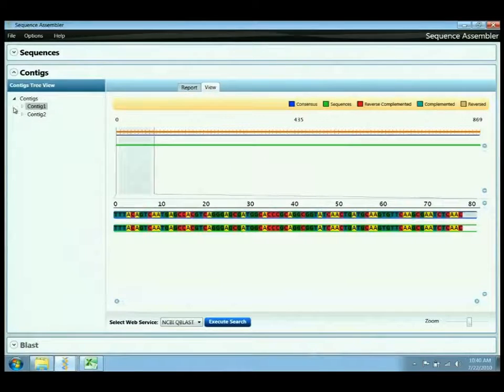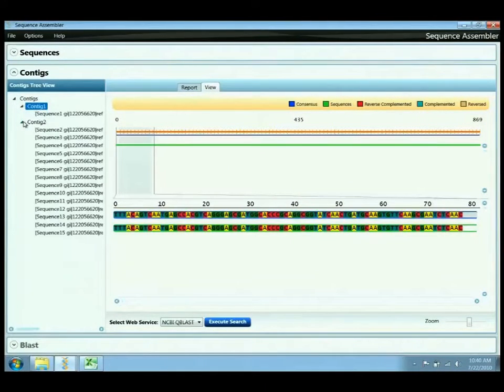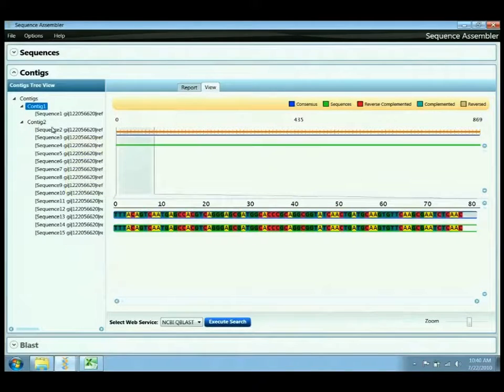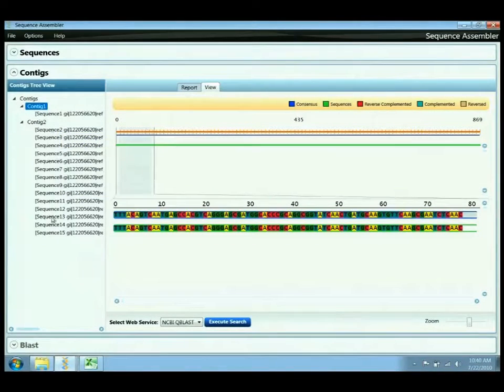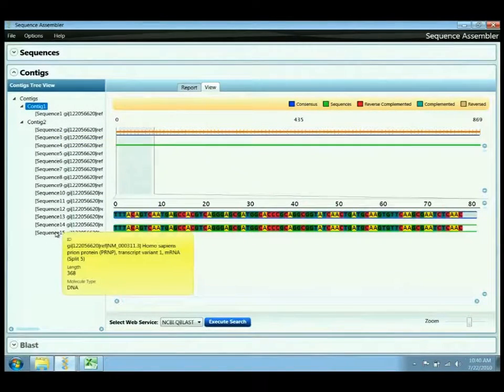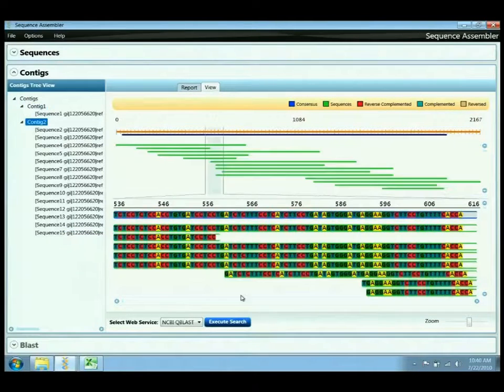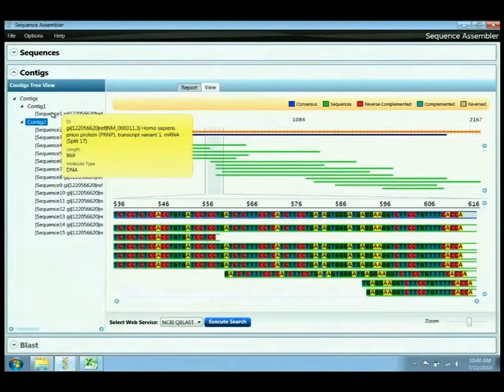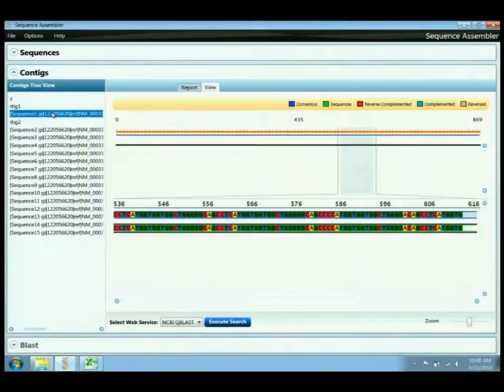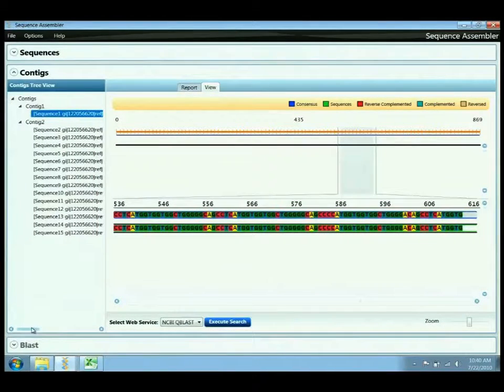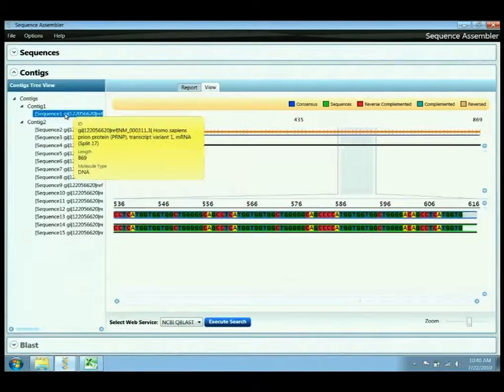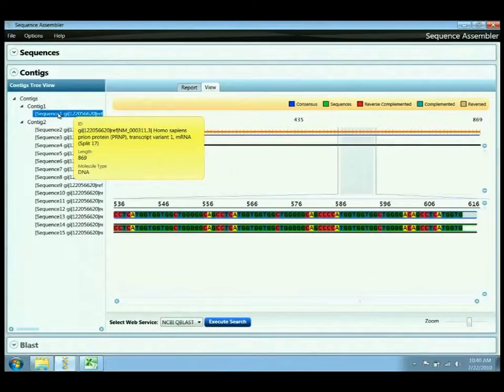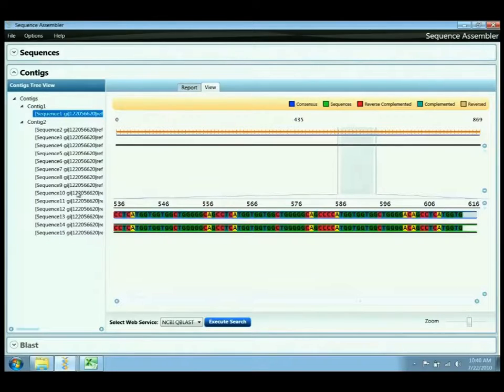Now this is significant because what essentially the algorithm has said is that in contig 2, sequences 2 through 15 have all aligned or assembled very well, and you can see that by selecting this contig and viewing the assembly of the various sequences. However, sequence 1 did not satisfy the requirements for assembly and therefore is considered a separate contig or does not align or assemble with the others. This shows the limitations of the assembler and also of the input parameters because these all should align.